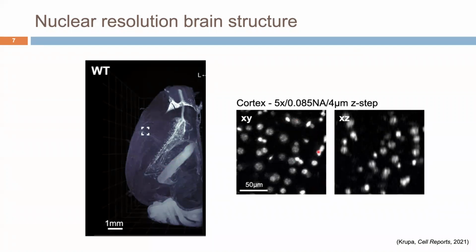Zoomed in on the right side here, you can see that these images provide sufficient resolution for visualizing individual nuclei in the brain of a P14 mouse, both in XY and XZ.